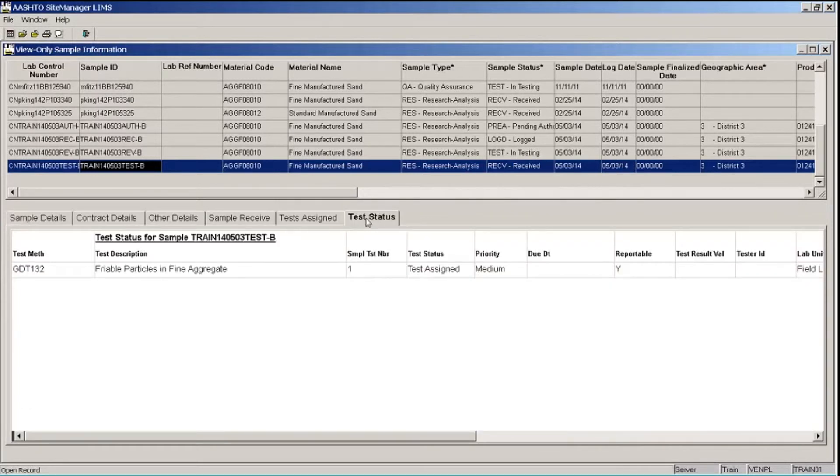And the Test Status tab will show the status of each of the tests that are assigned to the sample. This does not show test results, only the status of the tests.